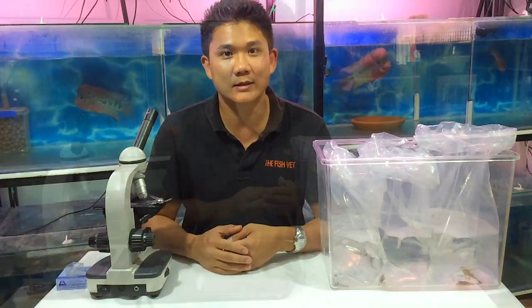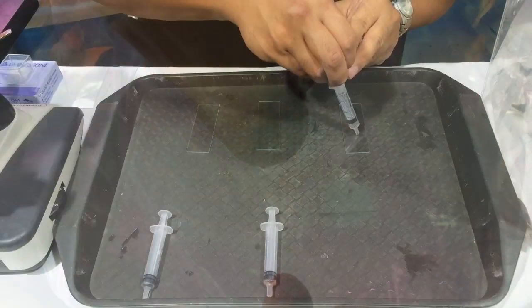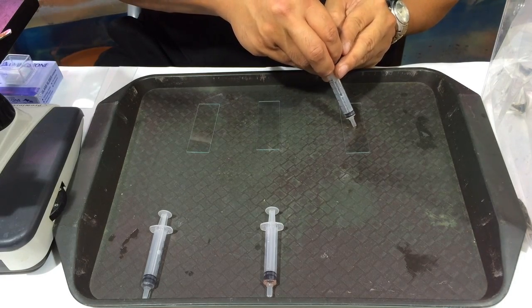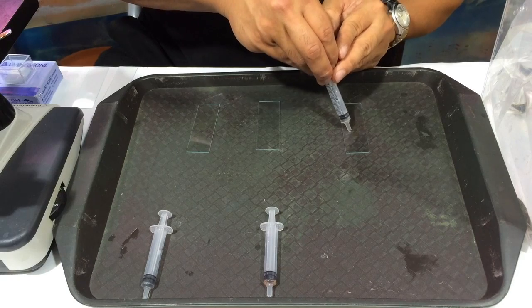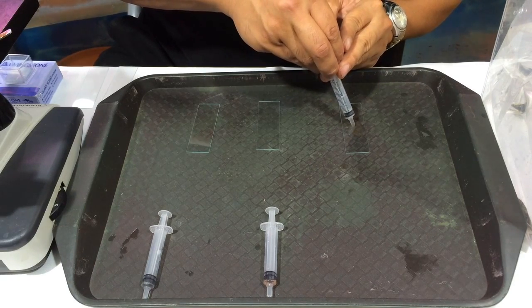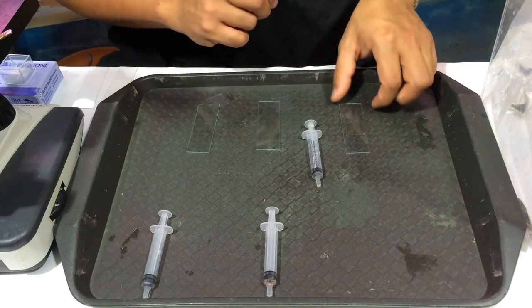We're doing some examinations of the stool samples to look for evidence of enteric parasites, or things that come from the intestines that are passed down through the feces. So we're just going to collect some samples. Here we've got the stool sample from the Gibiceps catfish and we'll just break it up a little bit by going up and down with a syringe. Then we'll just remove excess water, put the cover slip on, and then we can examine.